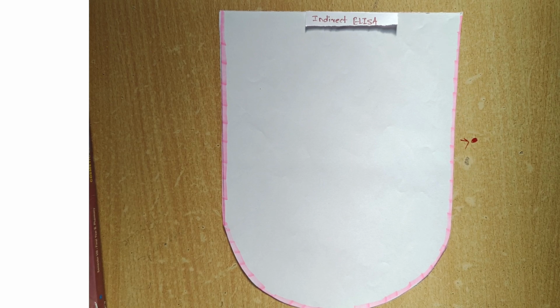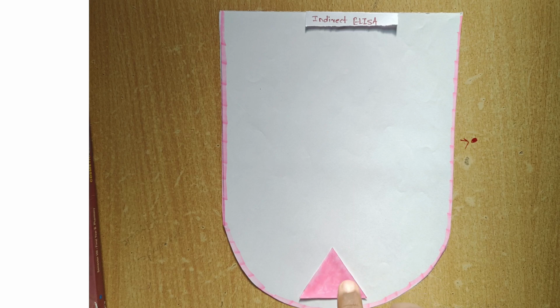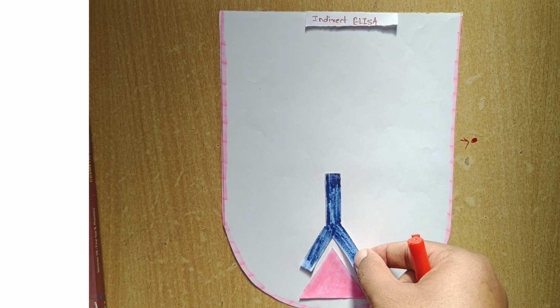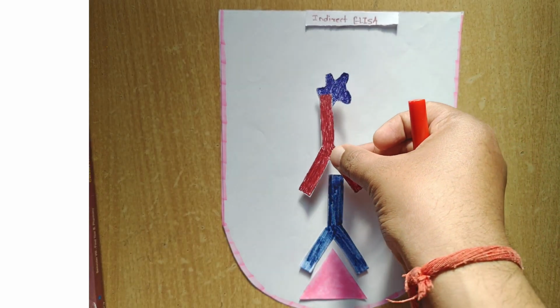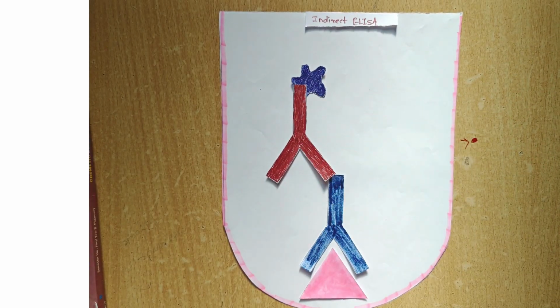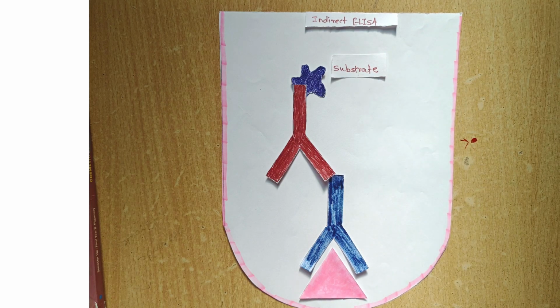Indirect ELISA. In the indirect ELISA, the compound is added to the polystyrene plate. The primary antibody is added which binds to the compound. Then a wash is given and the enzyme-linked secondary antibody is added. Again a wash is given and the substrate is added, which converts into the colored product and is measured by the colorimeter. This is the indirect ELISA.